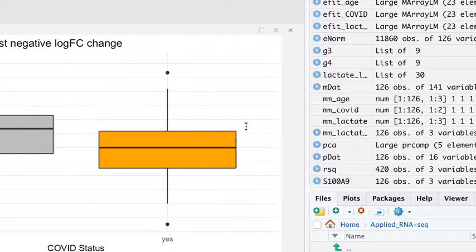Actually, again, it depends. You can remove those outliers, but that means you'd also be removing a lot of other data, because it might not just be this one gene. There might be several genes that are showing such high outliers. That means you're reducing your data as well, but that is definitely something you can do. The only thing is, once you do that, you would have to normalize again. If you're just doing it on the raw counts, that's fine. You can follow the normalization method.